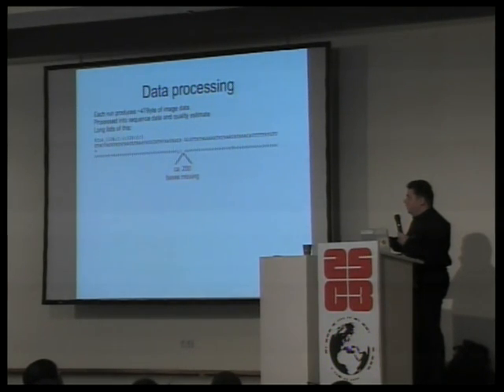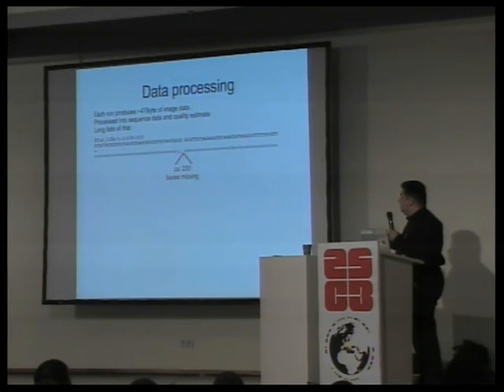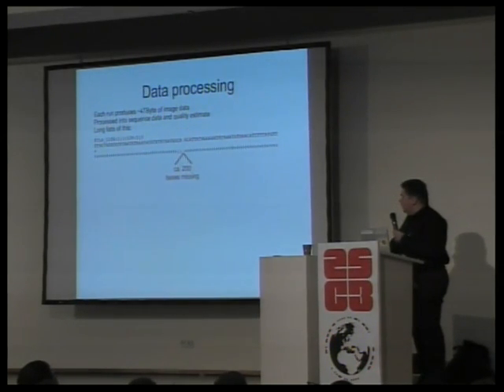And then you have here a quality score, which is ASCII encoded, which basically says the machine has a certain quality score of how sure the machine is that this is really an A in this case, which is, believe me, not a reliable metric, so it's a best guess.